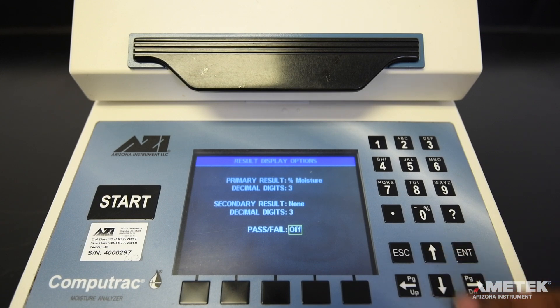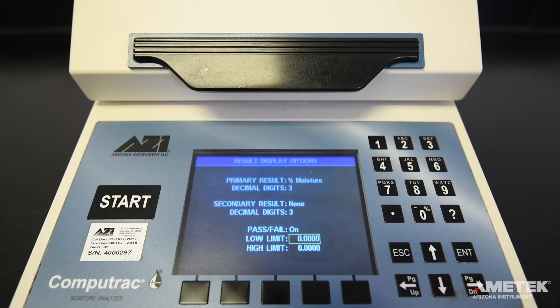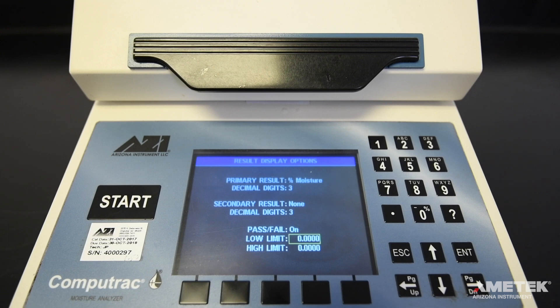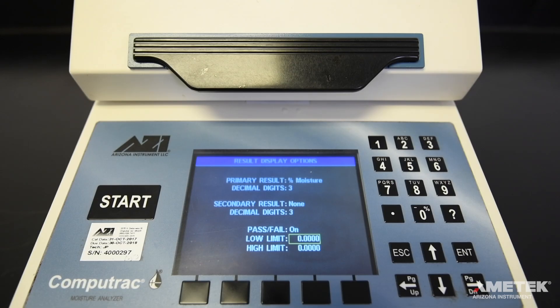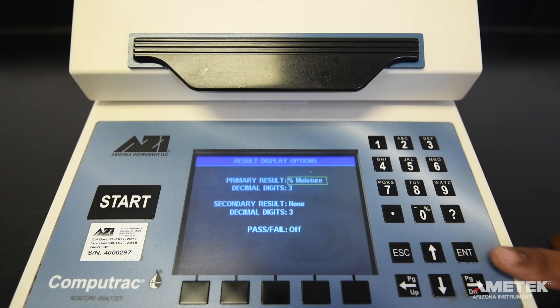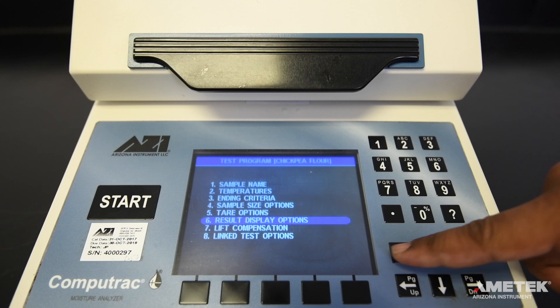The final field on the result display option screen is the pass-fail option. When enabled, the primary result is compared to the high and low limits. If the result is within the limits, the screen will turn green; if it falls outside those limits, it will turn red. The test results list also indicates pass or fail by using green or red text for the result. To use the pass-fail feature, toggle it on using the arrow keys and press enter to save it in the on position. Enter high and low limits, making sure to enter the high limit first. If you do not wish to use this feature, simply leave the pass-fail option marked off and press escape to return to the previous menu.